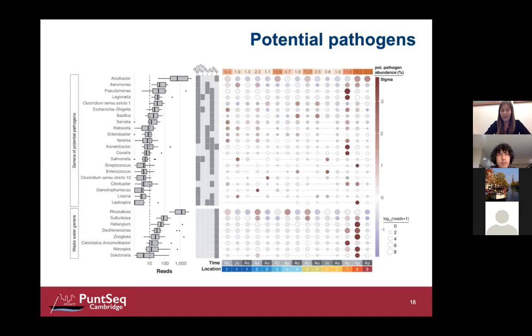You might think, why didn't they go down to the species level? We were quite wary, given the still quite elevated error rate of nanopore sequencing, to go to the species level just by default without actually looking into our reads. So this overview analysis we still did on the genus level. By the way, we estimated in our flow cells, but as I said, these were the old versions, that we had an error rate of around 8% in our reads.